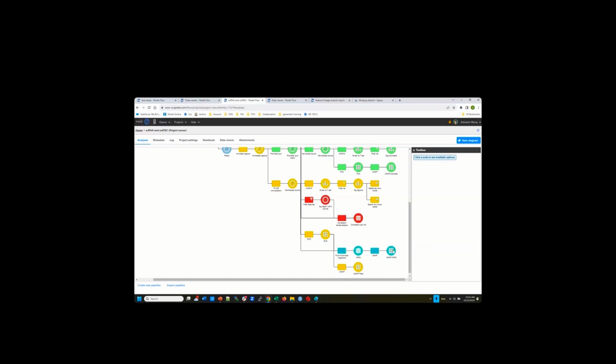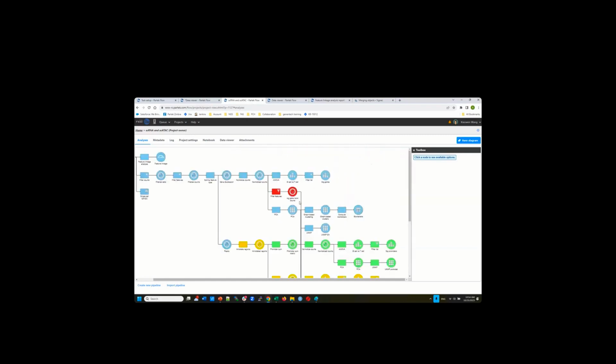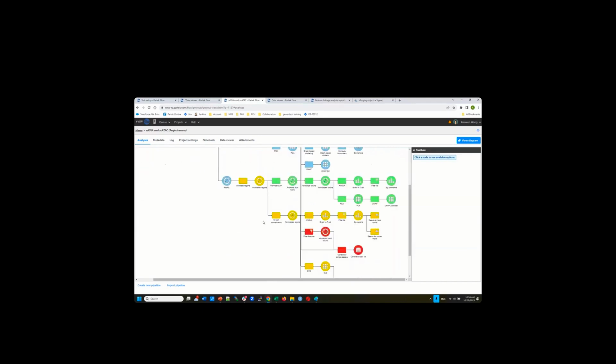To perform that, you have to work on the count matrix data node. So I will choose the normalized count matrix data node. I don't want to correlate all the 13,000 genes with the 80,000 features here. That computation is going to be very expensive, and the table is going to be huge, right? So I would recommend you only use your significant ones.